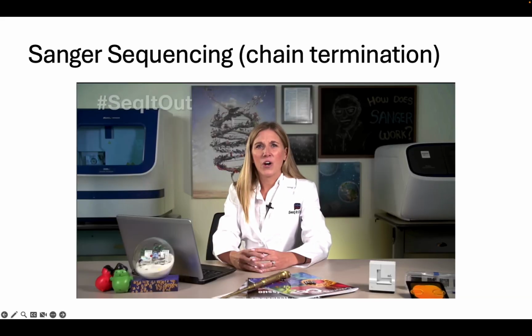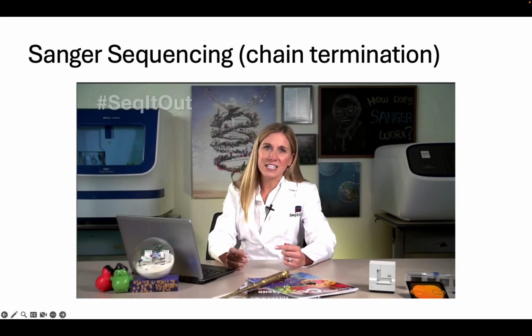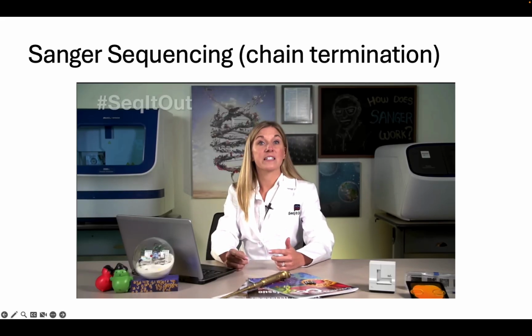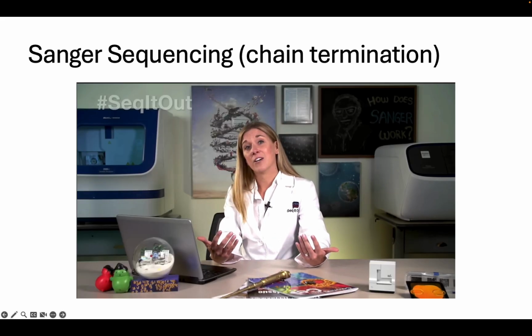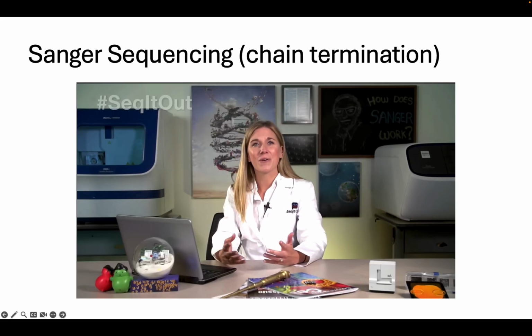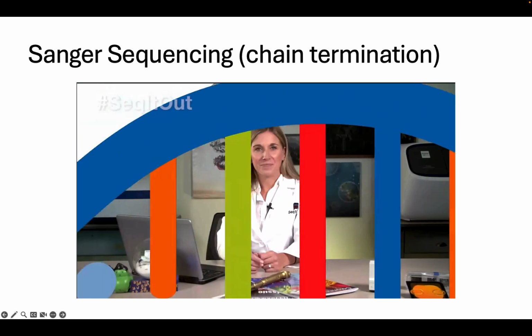Many might ask, why is it called Sanger sequencing? Well, Sanger sequencing is named after the inventor of this groundbreaking technology, Dr. Frederick Sanger, who I like to call Fred, who developed this method over 40 years ago in the mid-70s. So what are the basics of Sanger sequencing? Let's take a look at our lab book.